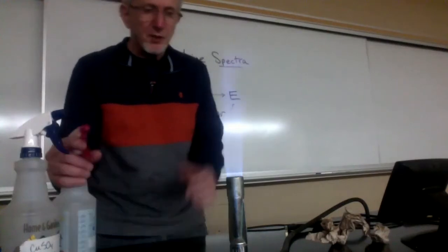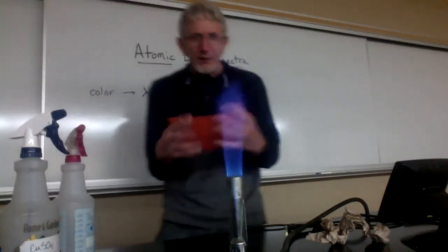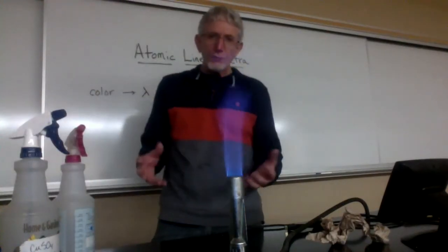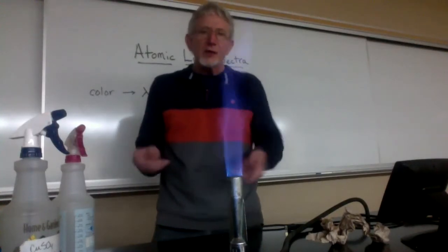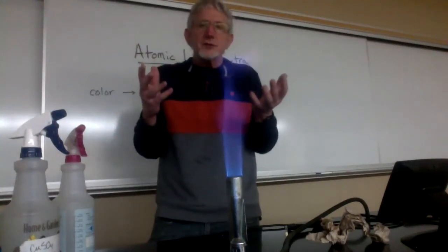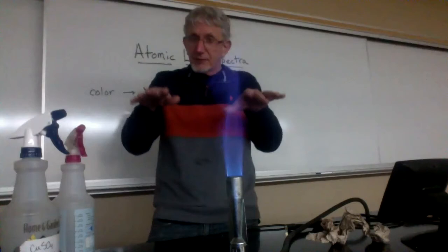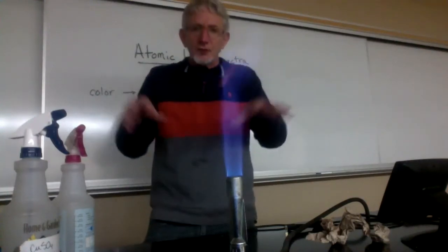Now when I squirt that alcoholic solution into this Bunsen burner flame, the alcohol is going to combust. It's an exothermic reaction. That heat energy is going to be absorbed by the atoms. They're going to be kicked into higher energy states.